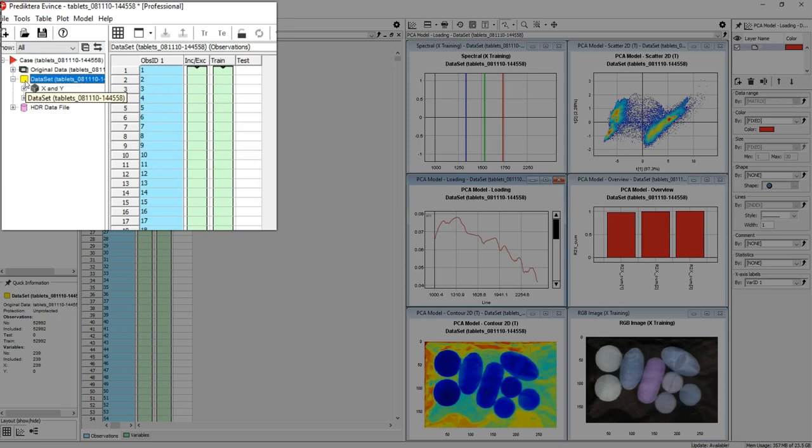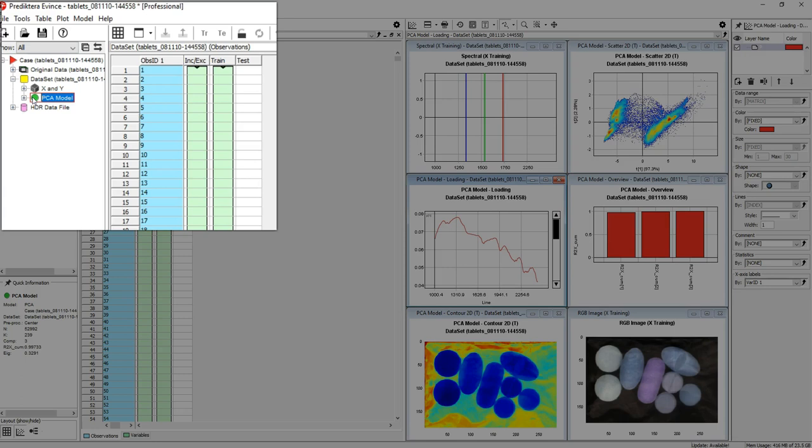In this example there is also a PCA model made from this dataset. By clicking on the plus sign next to each symbol, you can expand to see additional data relating to that dataset or model.